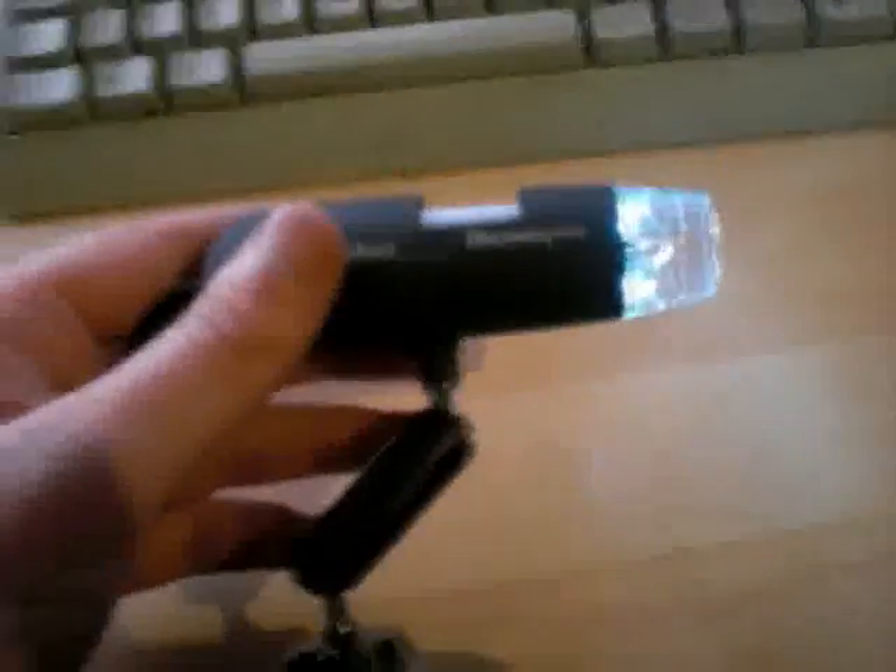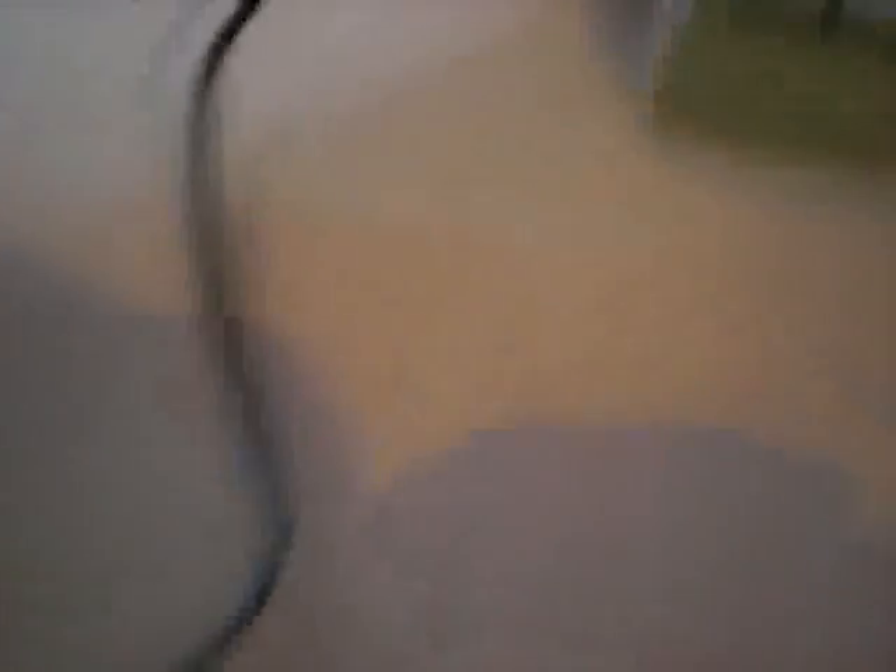This is a USB microscope. The wire goes around here into my USB hub. As I turn this around, obviously what's on the computer screen has been affected by the microscope.